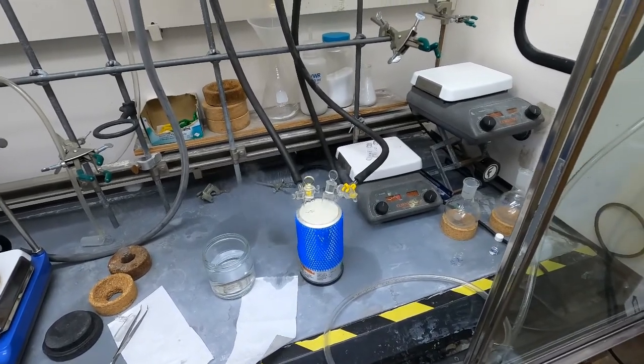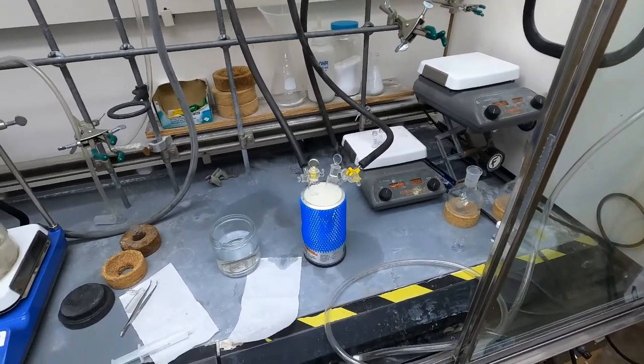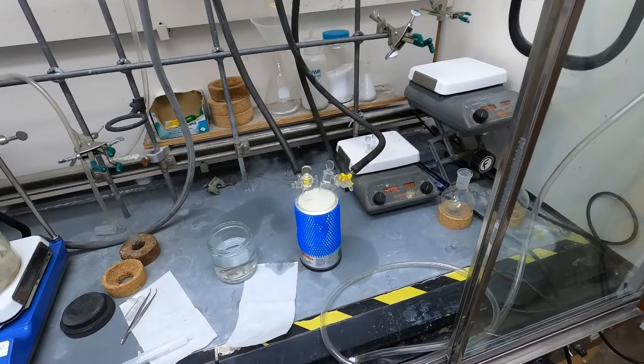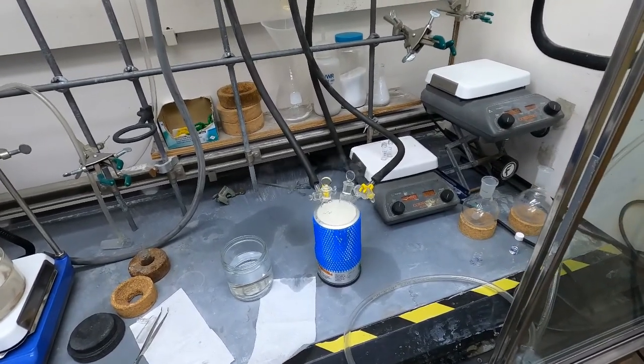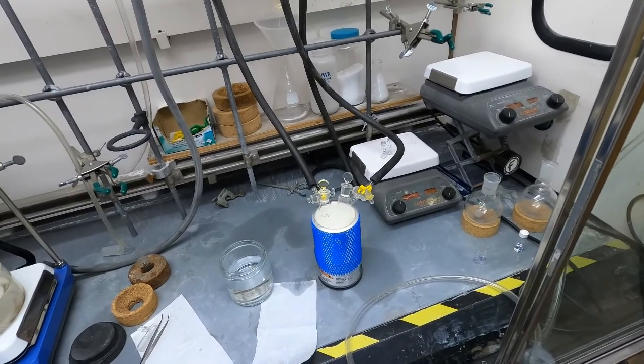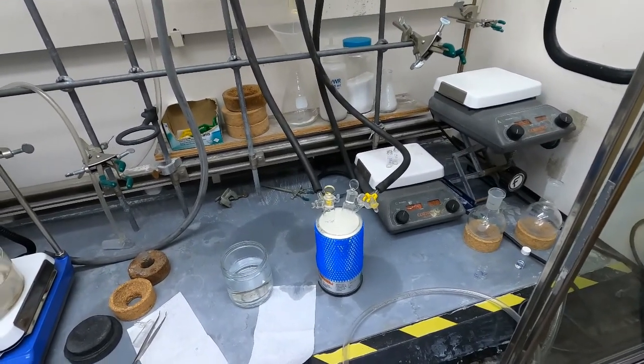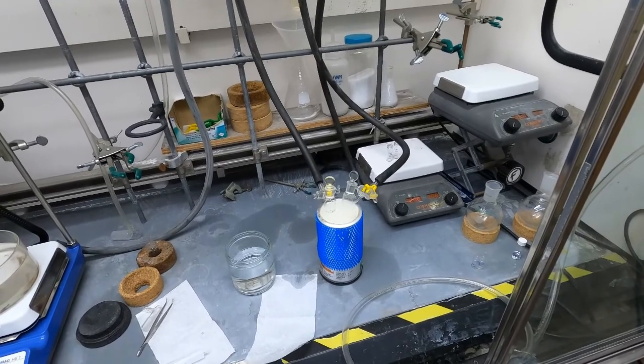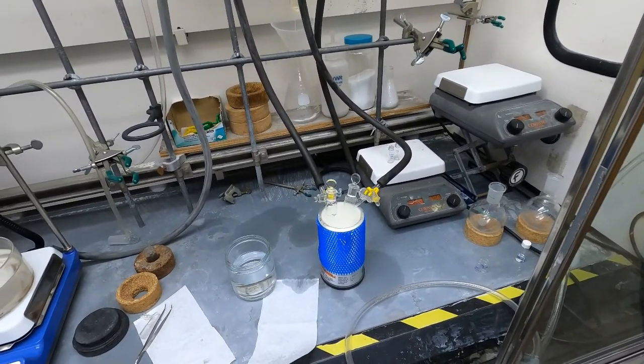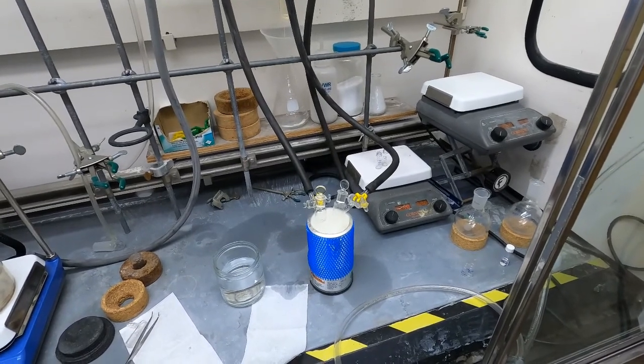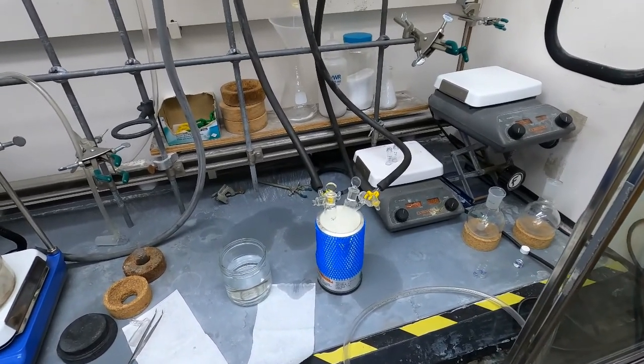The purpose of a freeze pump thaw is to get all of the air and specifically the oxygen that could be bad for a reaction out of the reaction mixture. We freeze the solvent and after the solvent is frozen we're going to open the stopcocks out to vacuum, basically removing the head space in these Schlenk tubes.